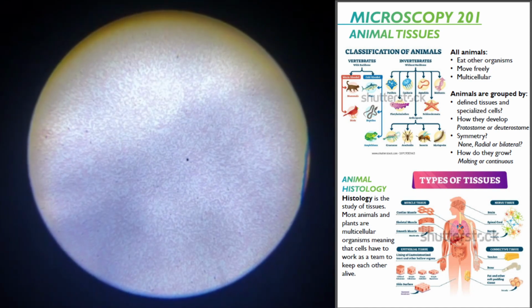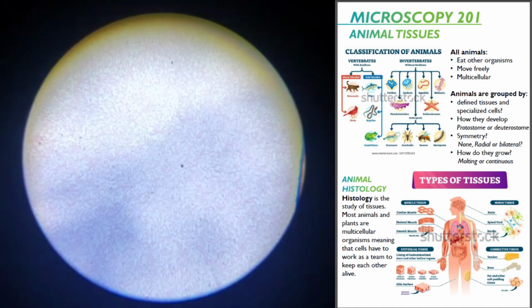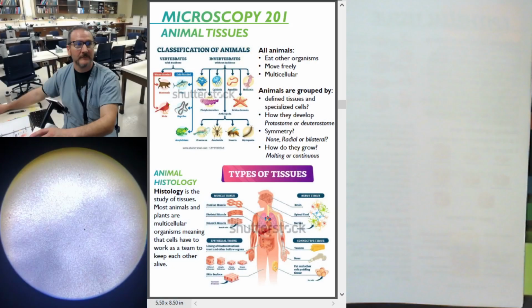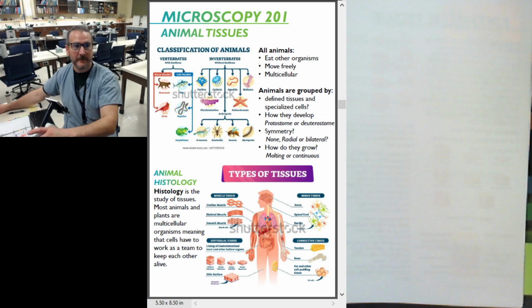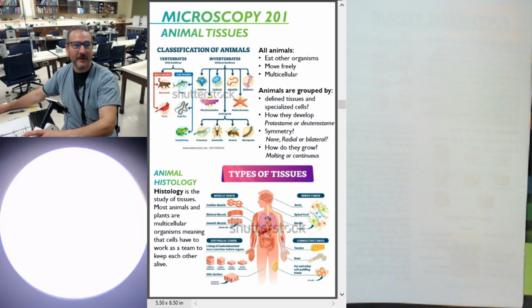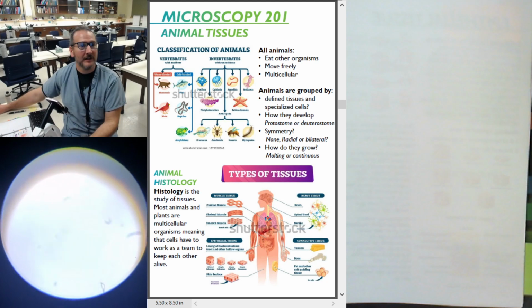Okay, perfect. All right, so I'm about as clear as I think I'll get. I'm going to take my revolving nose piece. So I'm grabbing the revolving nose piece. I'm going off the 4x, which is 40 times total magnification, remember? I know, isn't it annoying that I keep saying that over and over again, but at some point, you're going to think it before I can actually say it out loud, and that's when I know that you're learning really well.